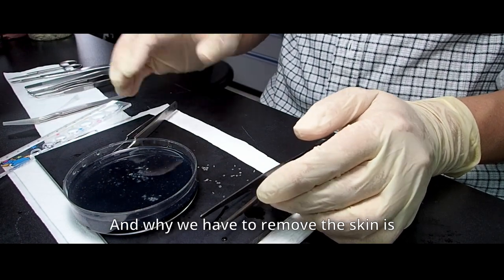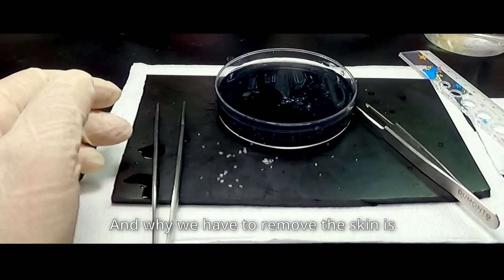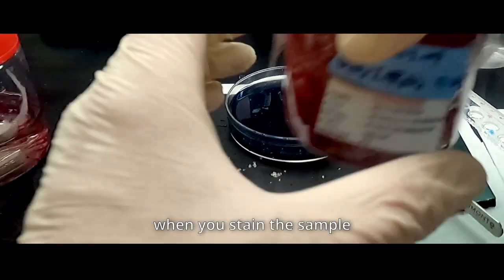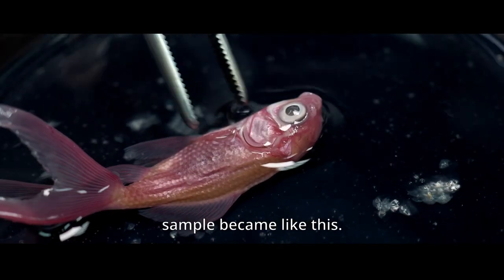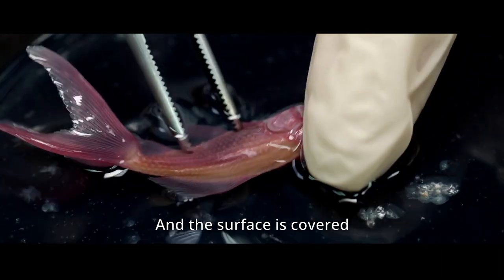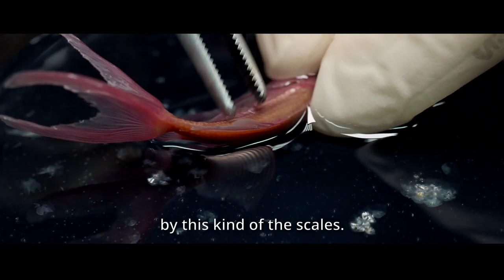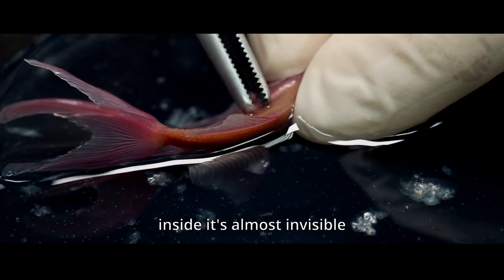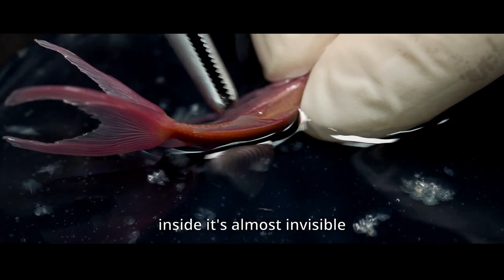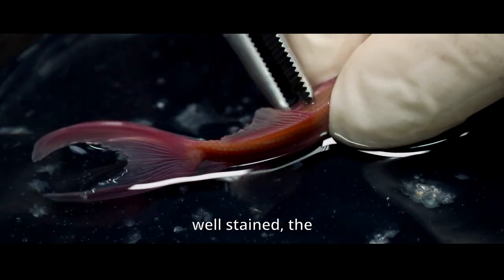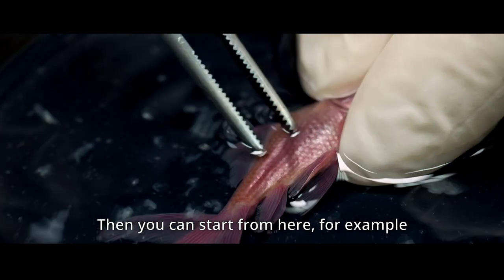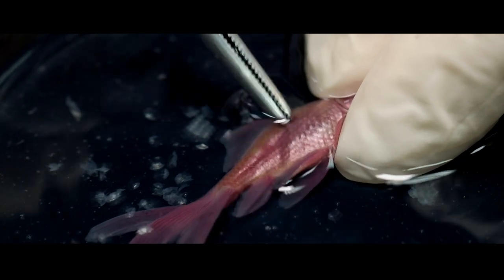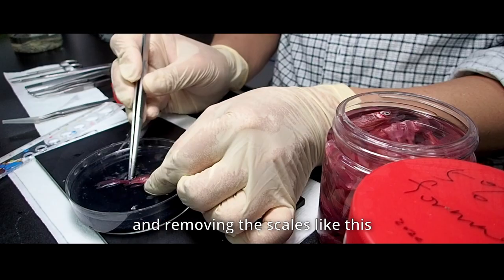And why we have to remove the skin is, when you stain the sample, like with alizarin red, the sample became like this. And the surface is covered by this kind of scales. If you want to see the inside, it's almost invisible. So then, because the surface is covered by the well-stained scale, the calcified scale. Then you can start from here. For example, like stain like this. And removing the scale like this is also one of the options.